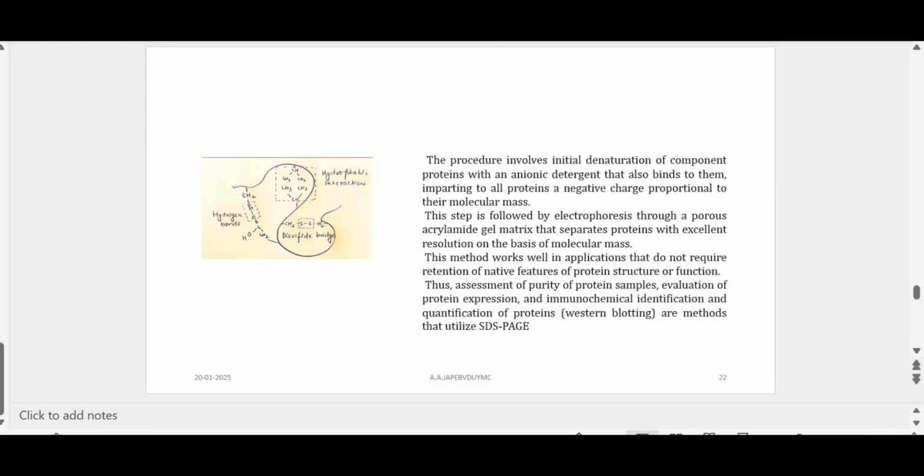The chemicals, or rather substances, that are used for destabilizing the quaternary structure of protein are collectively called solubilizers. The word itself tells you, solubilizing, right? For example, take a protein like RNA polymerase.